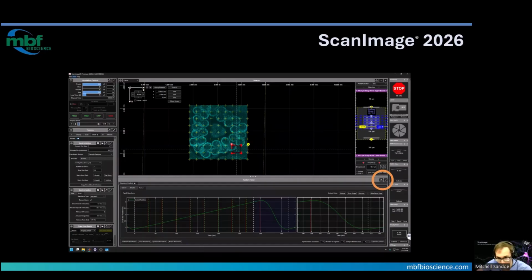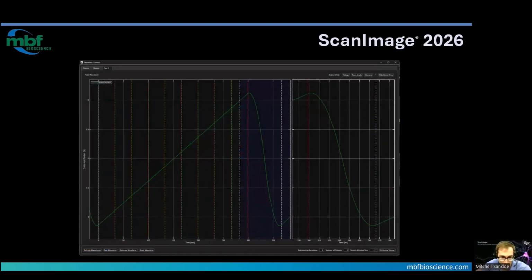The auxiliary panel, as well as the tabs contained, are undockable. To undock it, you can click this undock button, and it then inhabits its own window. So if you have multiple monitors, this is a great way to make use of them. Undocking is a feature of many panels, including the viewport and panels and tabs within the acquisition controls.